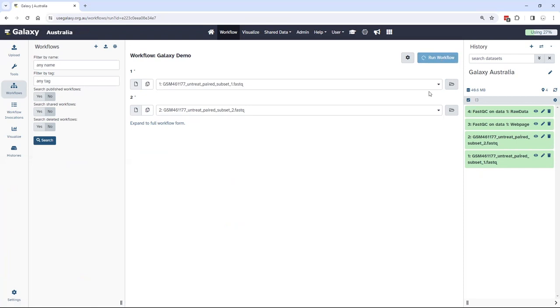The really nice thing about Galaxy is it has a sophisticated workflow management. It will schedule all these jobs, give them appropriate resources, but it'll also put the jobs into a wait status if they require prior results from that workflow.